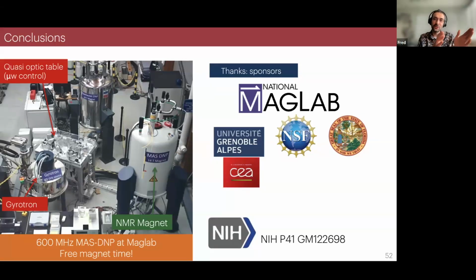So I just looked at the two extremes: the ideal conditions where everything is deuterated and we have a good control, and the more realistic case where it's a mess and you have lots of protons. But I will share a paper if you want later.